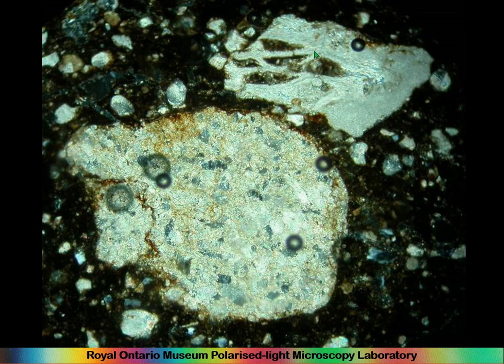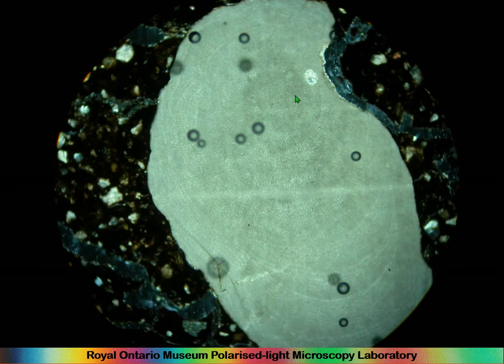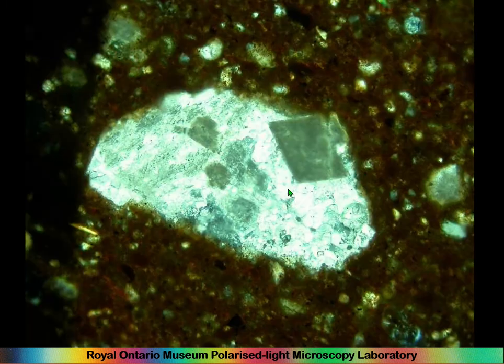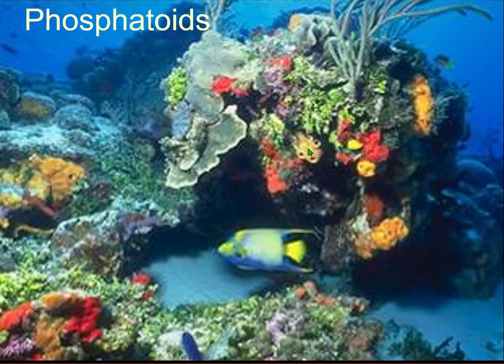And here we have something weird, some fossiliferous thing going on in this chunk of limestone. This actually looks like coral, which is also fun. And this, I don't know what's going on here. This looks very organic. This is a lump of carbonate, and you can see it's being replaced. This is calcite being replaced by dolostone, dolomite. Dolostone, yes. No, dolomite is the mineral, yes. So in this case, we can say the carbonate in this is calcite being replaced by dolomite.